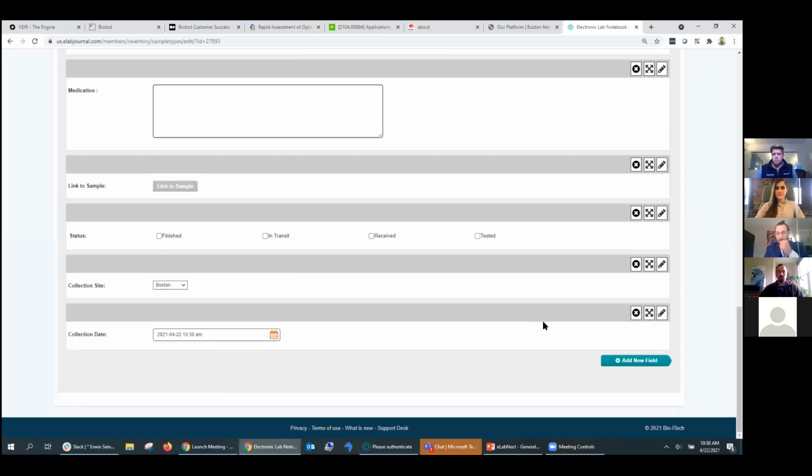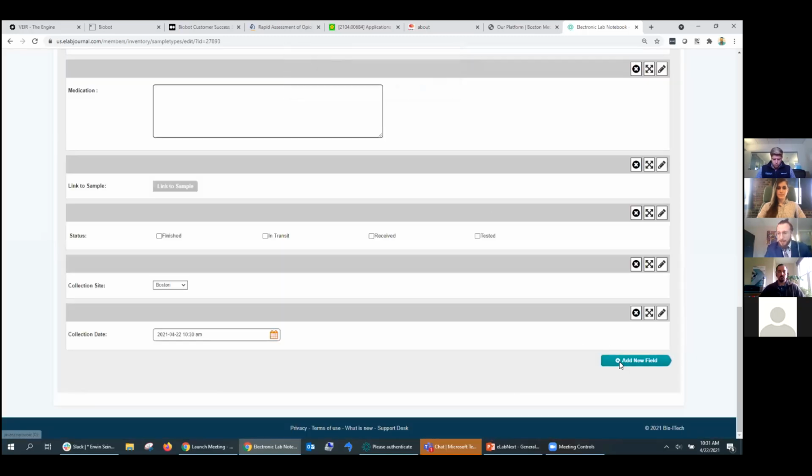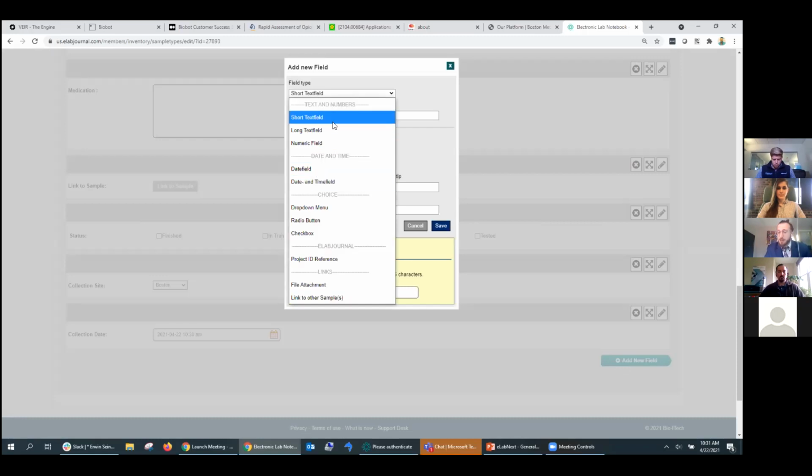And the good thing about this is that you can continuously optimize this, add more and more fields that you want to keep track of, and you can make them required fields also. When you make it a required field, then your colleagues are prompted to always fill in that information, and really that gives you that digital confidence that the work that you're doing is being saved and created, and allowing you to get back to it 3 years from now, be able to create reports and see, you know, the history of your company and the samples that you've been working with. So any questions about this portion of things, about customizing your sample types?